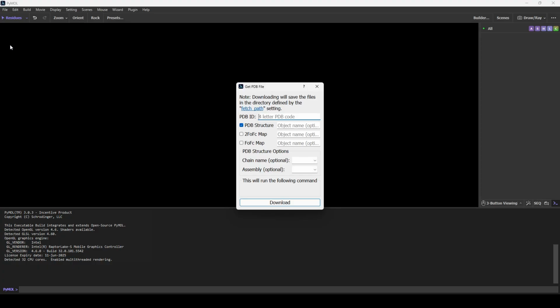In this prompt, you will enter the 4-character identifier for your protein structure. Each structure has a unique code. The same protein can have multiple structures in the protein databank, so there may be multiple codes for any protein. Different structures will have slight variations, such as the ligands of the protein, the solvent the protein was in when it was analyzed, covalent modifications, among many others.